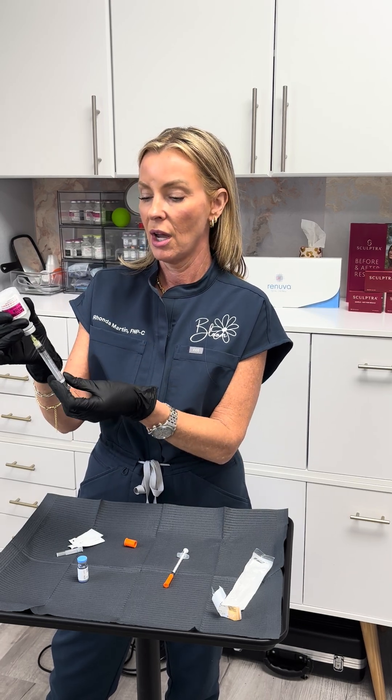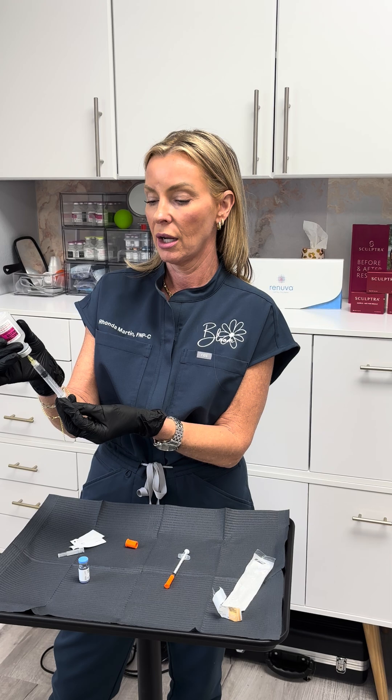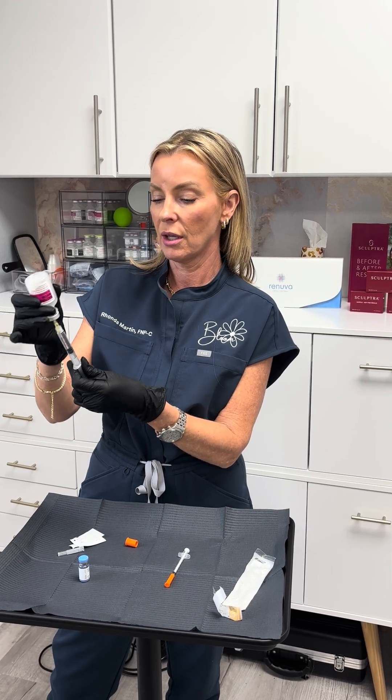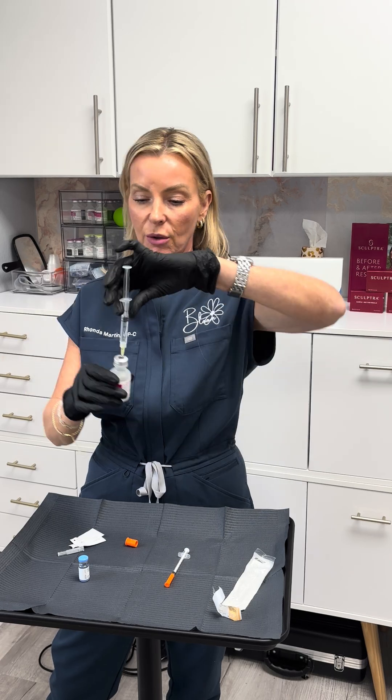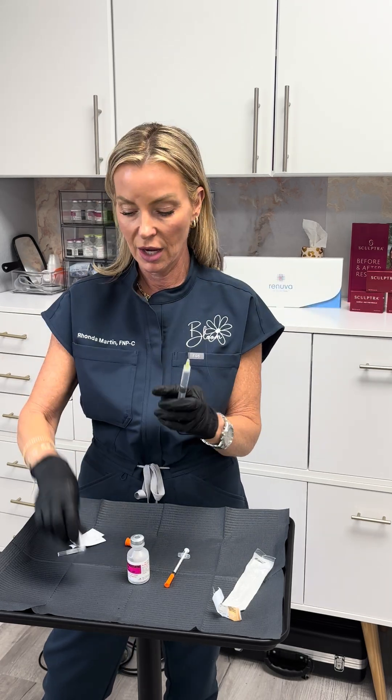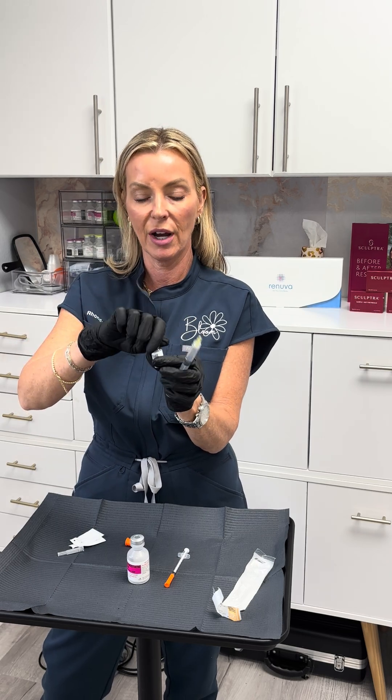Press the air into the vial, and then draw back 2mls of bacteriostatic water. Pull it straight out. Make sure you've got that, then pop the top off of your vial of peptide.